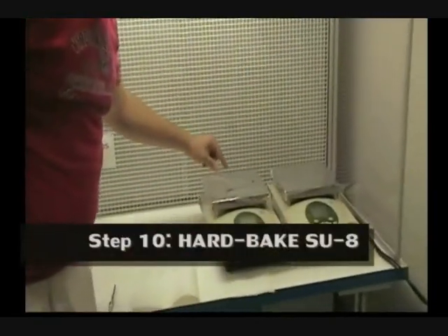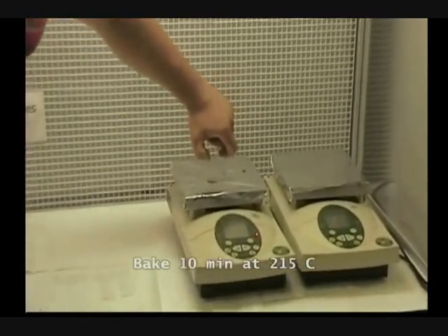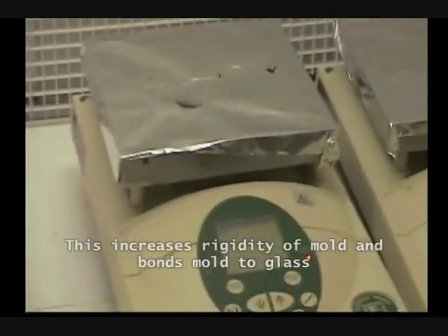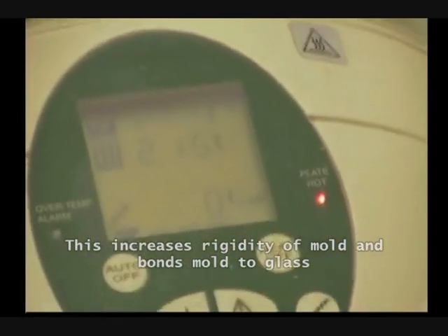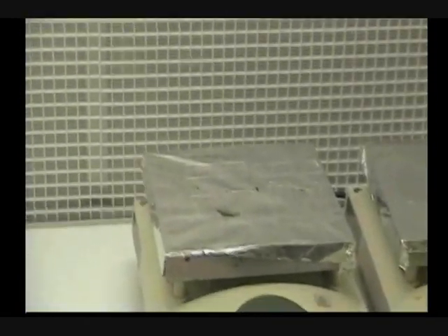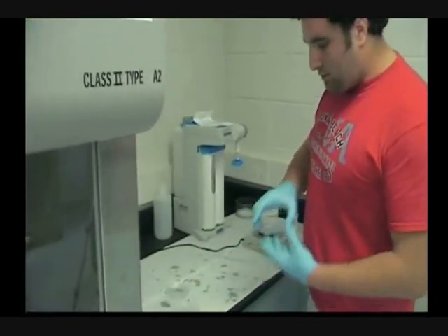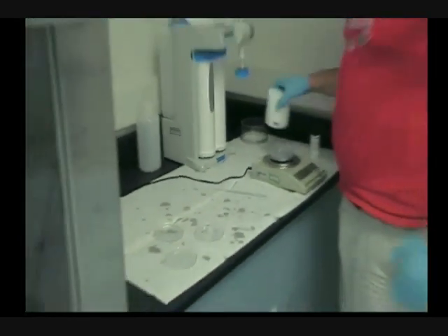We got 6 out of 8, now we are going to do the final baking, which we are going to bake our chips at 250 degrees for 10 minutes, which will increase the rigidity and the bonding of the pattern on the glass slide. Just take our glass slides off the top of the hot plate and we wait to cool them down.